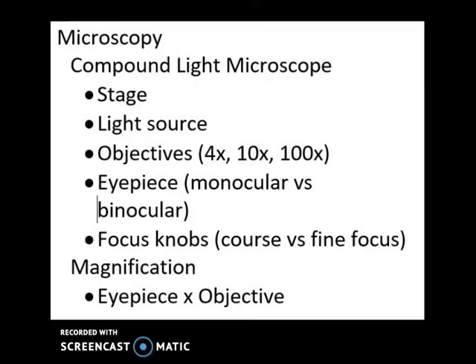In one of the first pages of your lab manual, there's a diagram of a microscope. Review, refresh, and learn all of those tools on the microscope, because they could be quiz material. Make sure you know what they do. If you aren't sure, ask somebody in the lab. It's kind of hard to do without a video or without you working on the microscope itself, so just review it, refresh it, look at it.